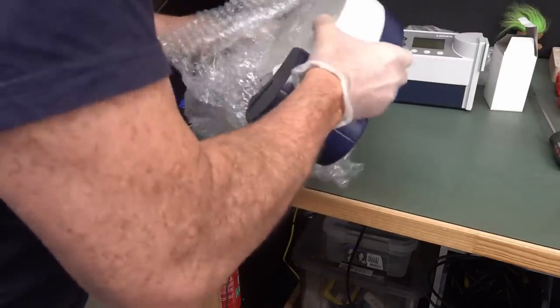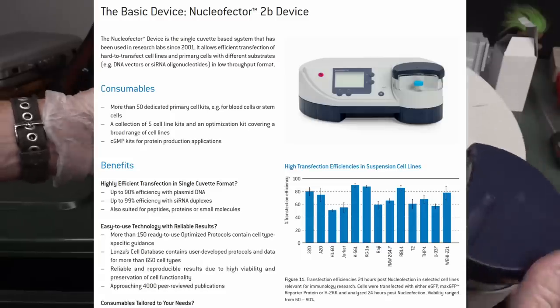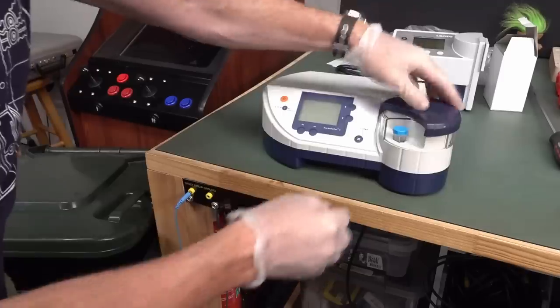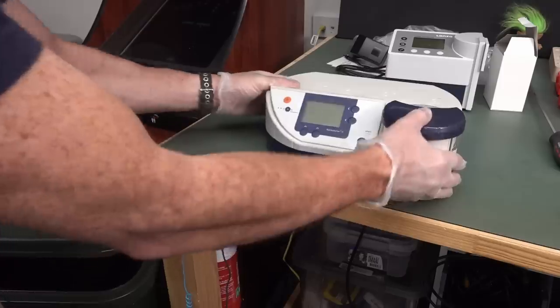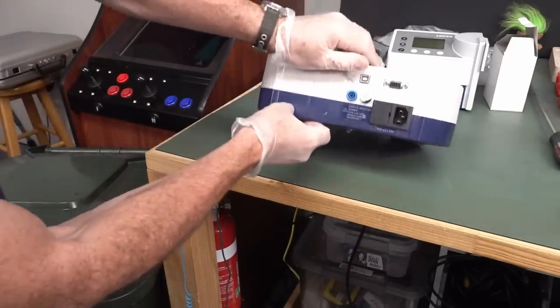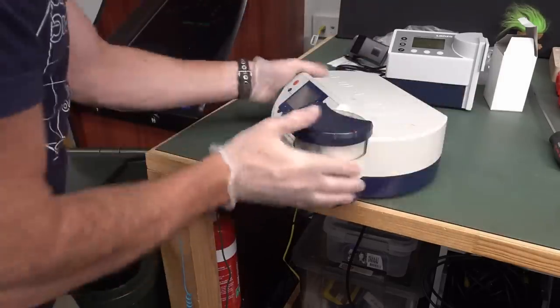Next, what do we got? Look at this thing. What is this? It's an AMA-X. What's an AMA-X? A Maxa thing? I don't know, it looks impressive. I thought that spun around, but no, that's where you put your vial or something in there and you spin it around and then it does the detectory bits on the inside. Oh, okay, there you go. External electrode sockets, use only with Amaxa certified equipment. Okay, but that is mains powered. Looks like it might have serial out.